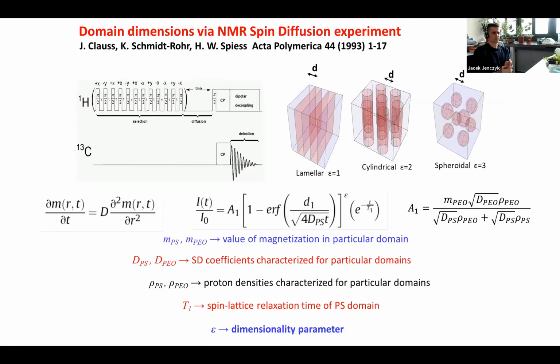And commonly used techniques like microscopy, either atomic force microscopy, or electron microscopy, scanning or transmission, do provide quite nice pictures. However, one is not able to tell anything at all about interfacial thickness using a microscopic approach.